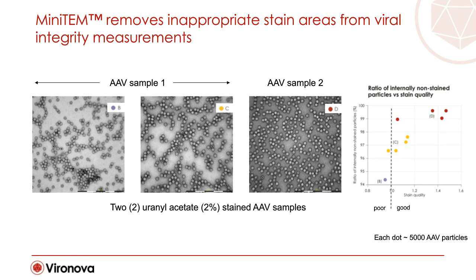When we scan for viral particle integrity status in these areas, we see a clear correlation between stain quality and particle integrity, which is an unwanted dependency. However, over a certain threshold of stain quality, the results stabilize and a comparable measurement between samples is obtainable.